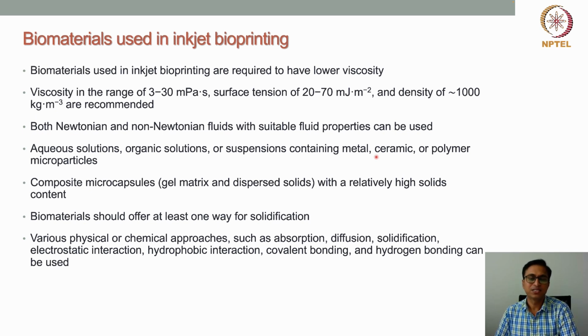Suspensions containing metals, ceramic, or polymer microparticles, when these microparticles are suspended in a particular medium, can also be used as a biomaterial for inkjet 3D printing.